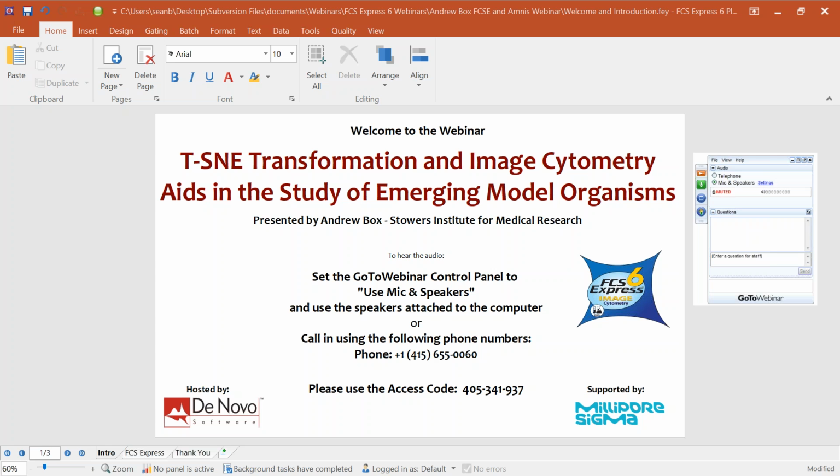The team at Novo Software is excited to be hosting the webinar today for Andrew to present his work as it combines many of the new and powerful features that FCS Express 6 offers, as well as utilizing the powerful imaging flow cytometry methods and techniques available from Amnis instruments.